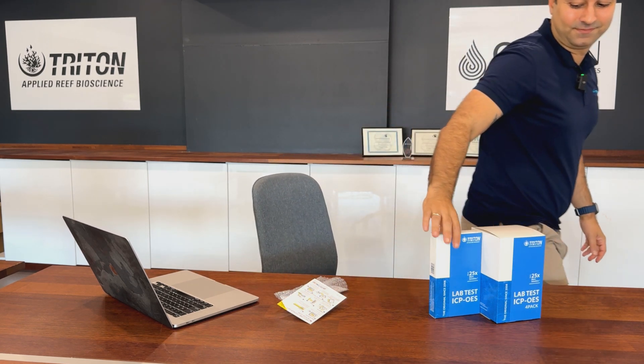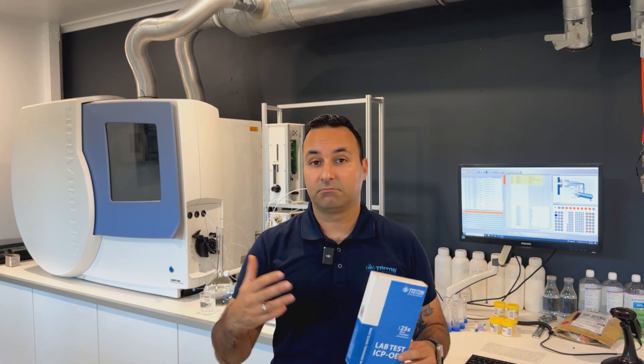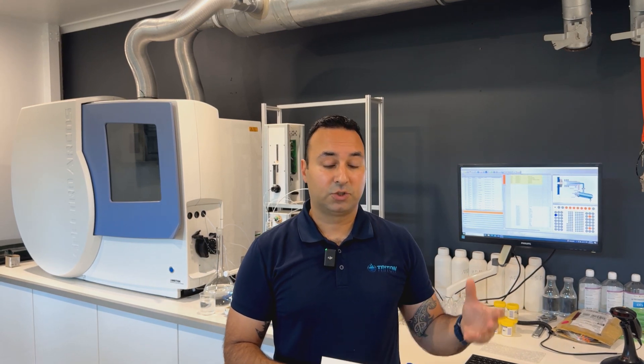Once we receive your test at the lab, we scan the vials and a lab technician loads them into the auto-sampler of the ICP machine. The machine runs for several hours and pushes the results to me for a final quality control check. Every single Triton test is personally reviewed by me, and that quality control combined with the speed of having a local lab is what makes this an unbeatable tool for reef keeping.